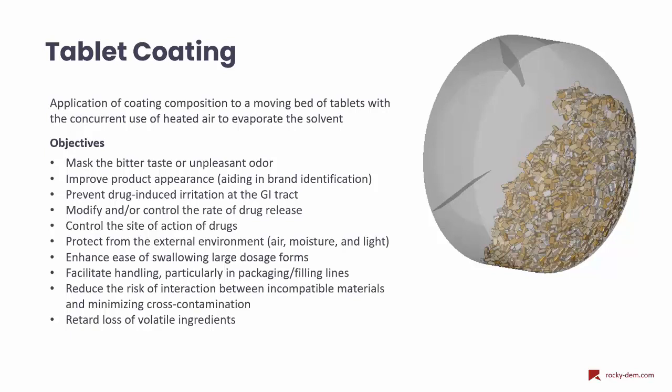It's also used to protect the drug from the external environment, for example, air, moisture, or light, in order to improve the stability of the drugs. It also makes it easier to swallow large drugs, and to facilitate handling, particularly for high-speed packing and filling lines, among other reasons.